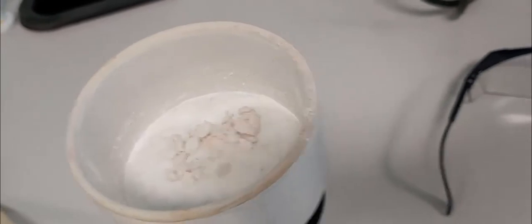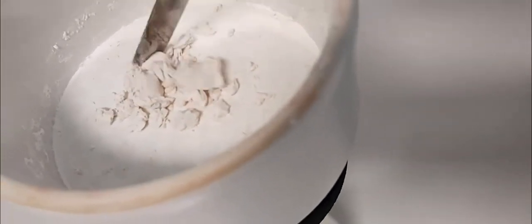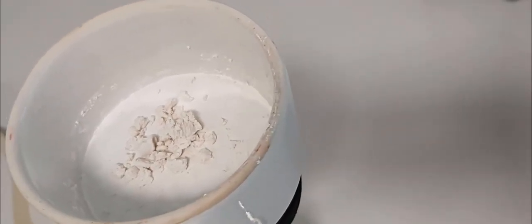The next step is to weigh the solid. Here we have a beautiful solid, an excellent powder. I will keep it just a few more seconds to dry — it is practically powder but may need a little more time. Then I will send you the mass of the product in order to calculate the yield of the reaction and put the results in the report.